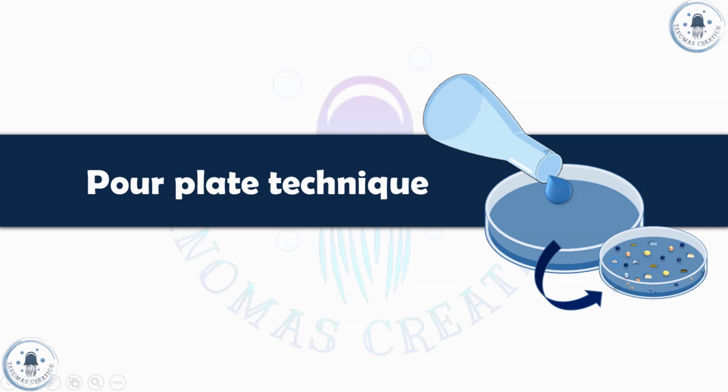Hello everyone. Today we are going to learn about pour plate technique.